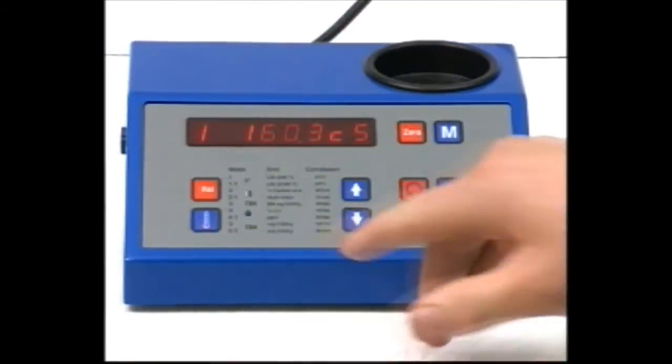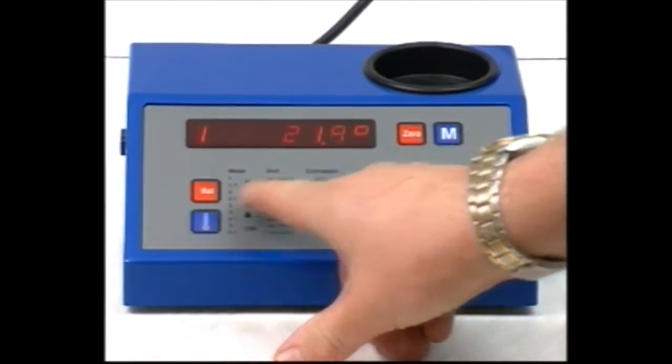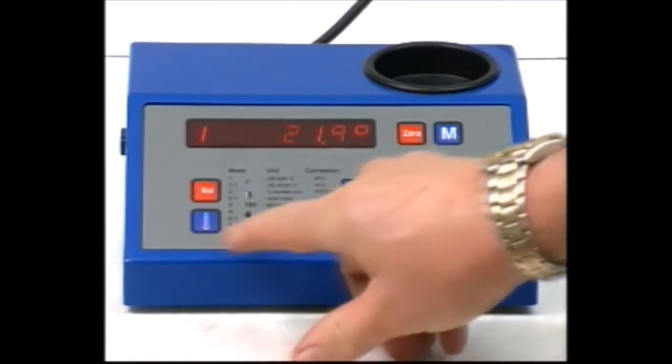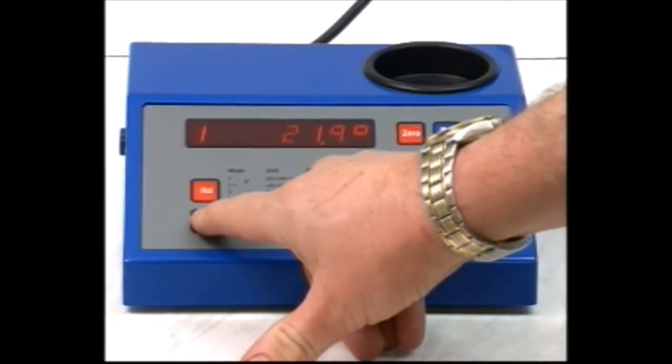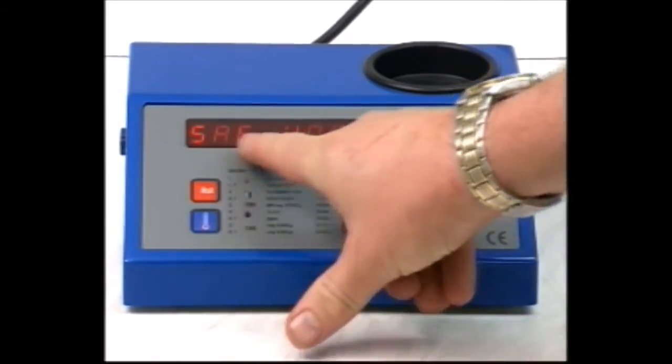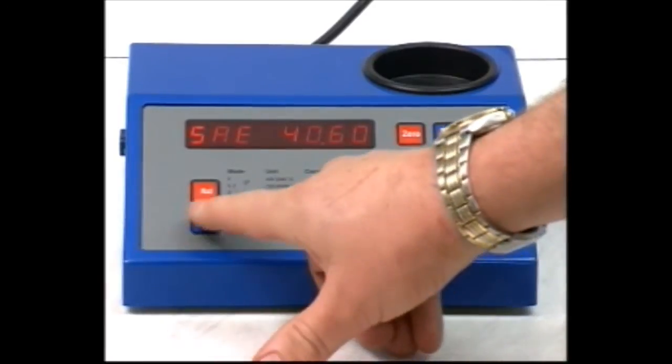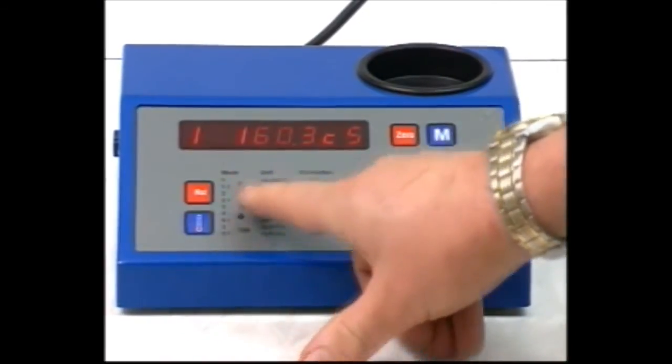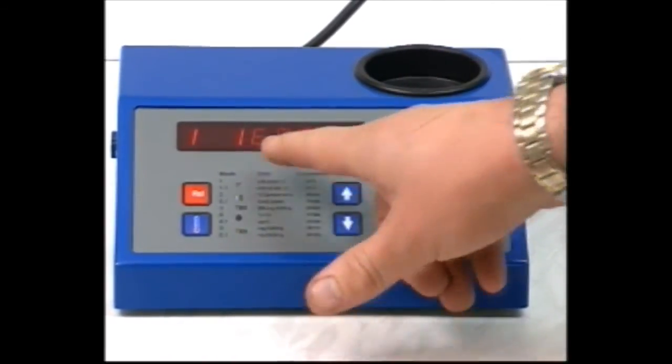If you press the temperature button once after a test, the oil sample temperature is displayed. Press it twice and it displays the SAE range. Press it a third time to return to Centistokes.